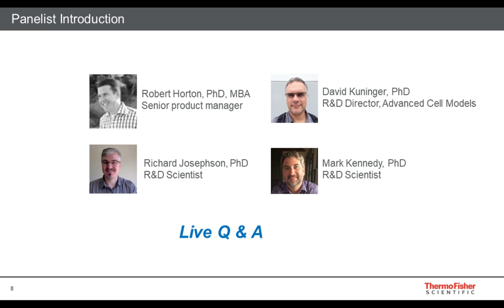There are some background suppressor reagents out there that I've tried that seem to help, at least in certain assays. I think the name of the reagent is something like BackDrop. There's also a so-called background suppressor in one of the Molecular Probes products called CyQUANT Direct that also seems to do a pretty good job of suppressing that background.